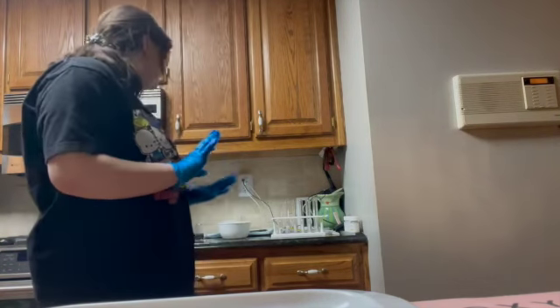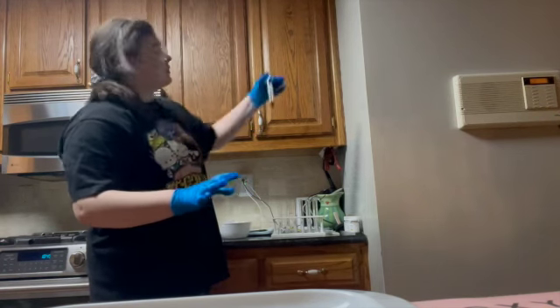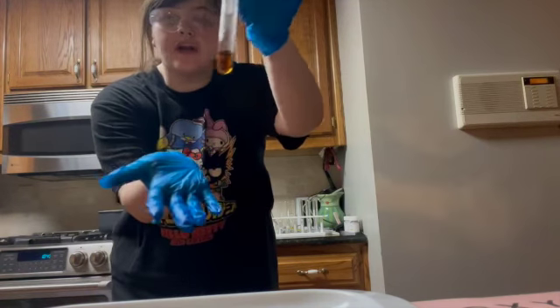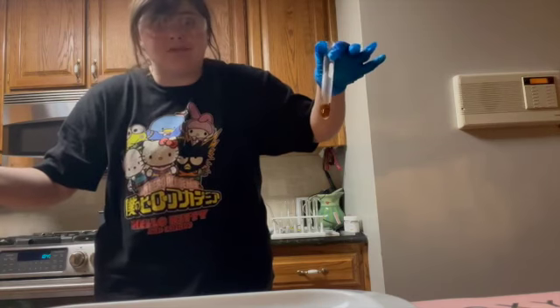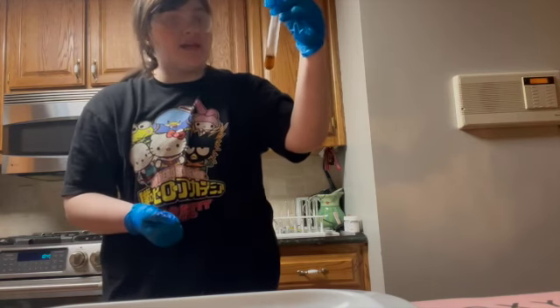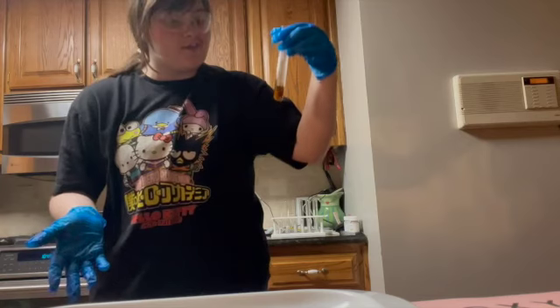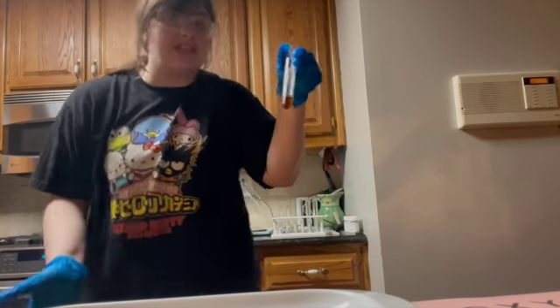Okay, so it's been taking a really long time. At the 57-minute mark for reaction 3A, we've got it to this amber, like dark orange color. So we're gonna wait a little more to see if there's any more drastic changes that show. But this is the biggest change that it has so far in the matter of close to an hour. So it might take even 15 to 30 minutes more to even see another drastic change like this.